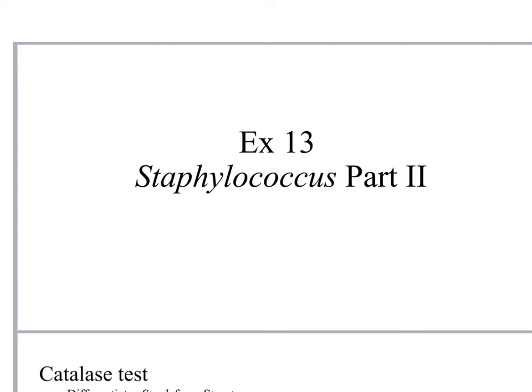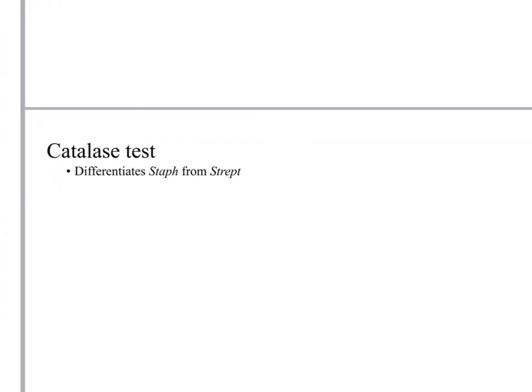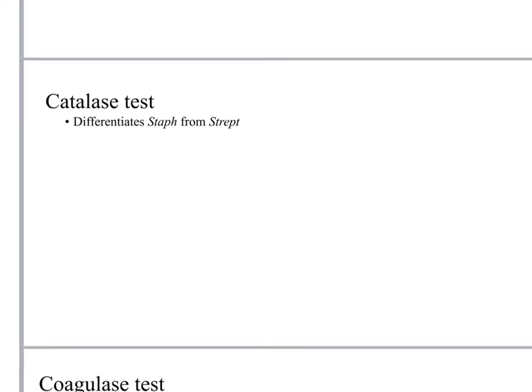Okay, so in addition to inoculating that CNA blood agar plate today, I'm also going to have you do a gram stain from that broth culture, that mixed broth culture. So it'll be a good opportunity to practice doing a gram stain from a broth because you're going to need to do that later on when you do your unknown. Okay, so in addition to gram staining and inoculating that selective media, you have 3 more things to inoculate.